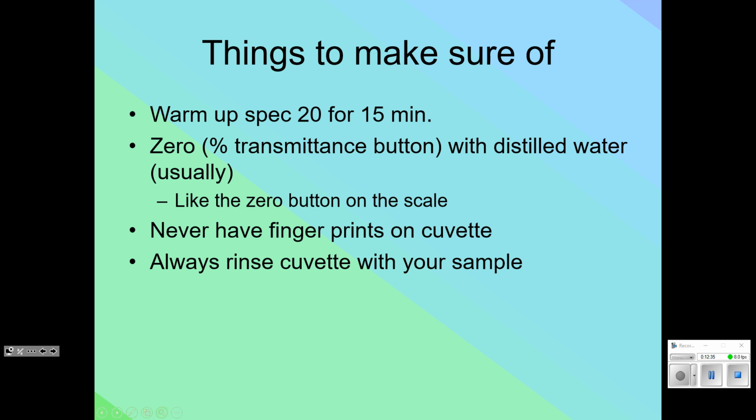No longer then is the molarity in here what I think it is. If you get yourself in that issue, once again, this really precise equipment is going to pick up on it. So it's going to say, here's the absorbance, but you're going to think it's for the molarity written on the bottle, but actually it's less than that now. It's kind of one of those sources of error when you turn to the lab to talk about sources of error.